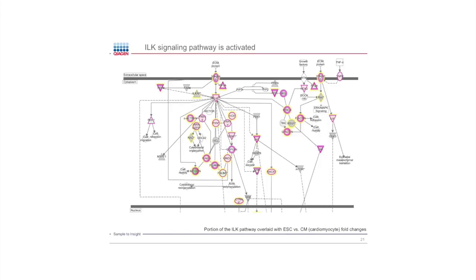Does regulator effect and upstream effect only use knowledge-based networks, or does it also use networking techniques to predict possible regulatory networks? I mean, it uses the knowledge. It uses algorithms that underlie the results, right? There's a z-score calculation.